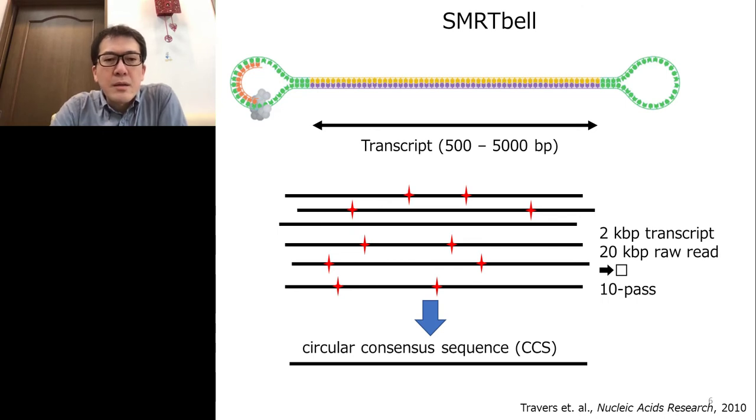So we prepared the cDNA libraries for the IsoSeq analysis. cDNAs are generated by reverse transcription.